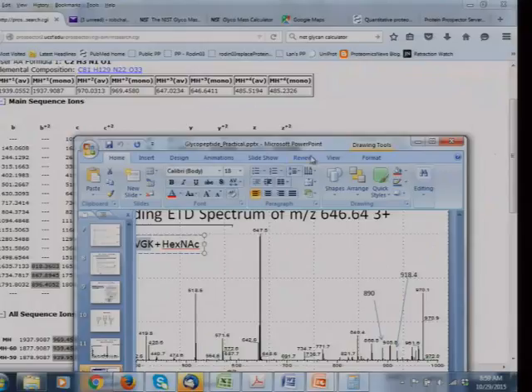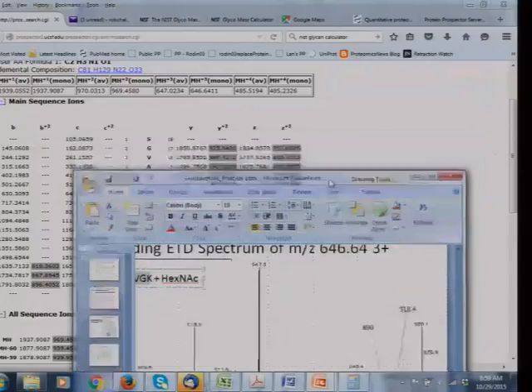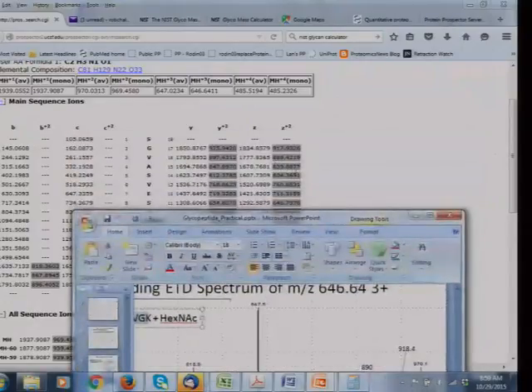And what's happening here probably is, the software has labelled the second isotope here at 840.4, when the first isotope should be 839.9. So this is a doubly charged peak, so therefore the isotopes are going to appear half an m over z unit apart, because we have to multiply everything by 2 to get the singly charged mass. And so what some of these peaks are doubly charged fragment ions.